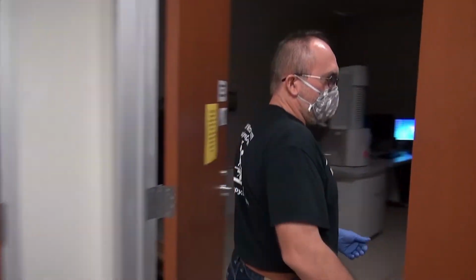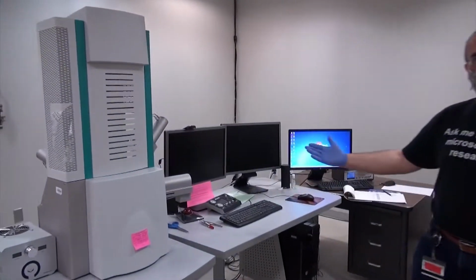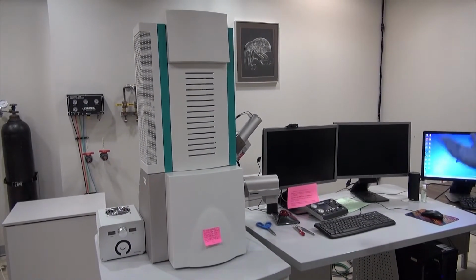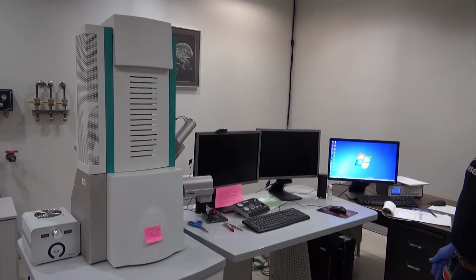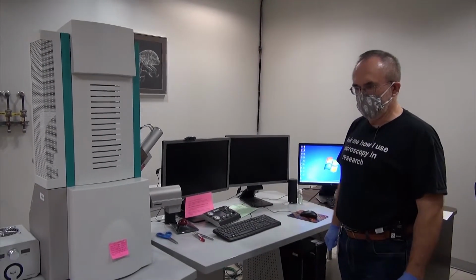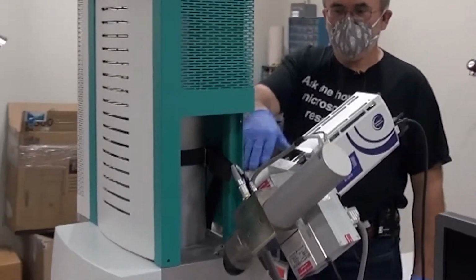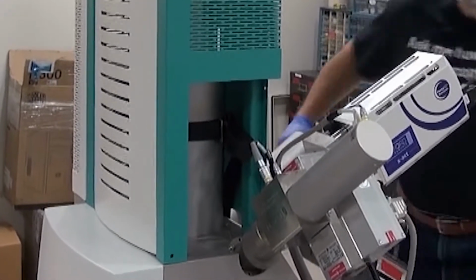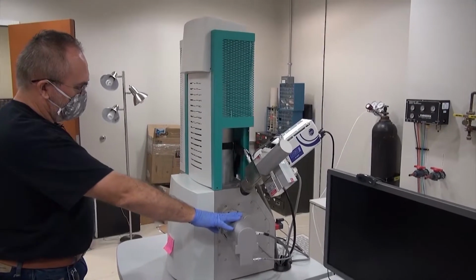So our center has 2 scanning electron microscopes, and the first one that I would like to show you is the Tescan Vega instrument. It's a tungsten filament instrument, so it does not have as high a resolution as the SEM that I will show you in a moment, but it's a really easy to use instrument. It's equipped with several different detectors, and I can point them out here. It has a secondary electron detector, it has an Oxford EDS detector, and there's also a retractable backscattered detector.